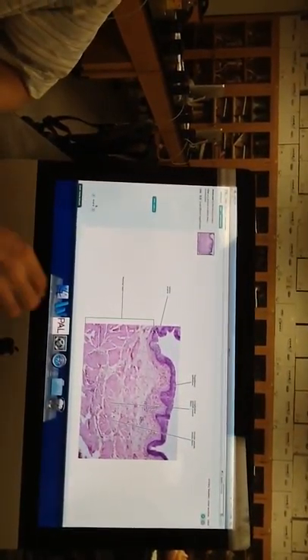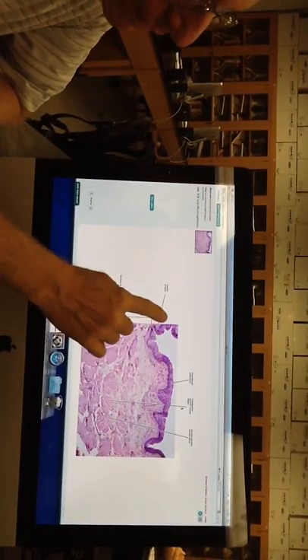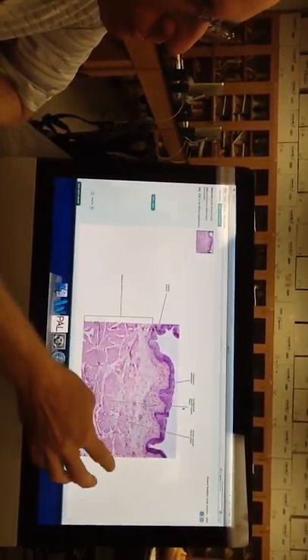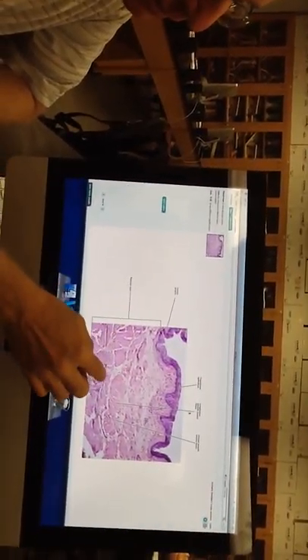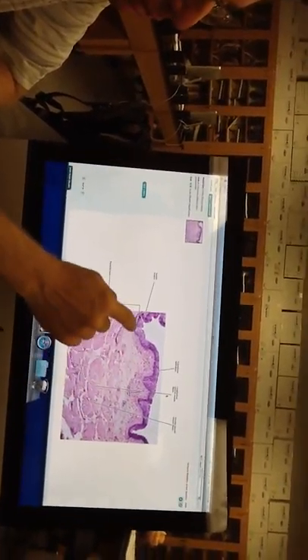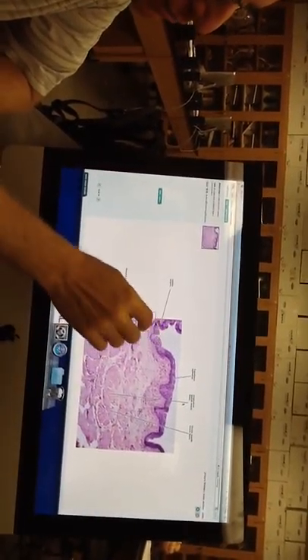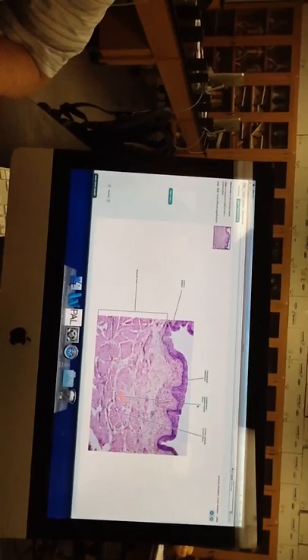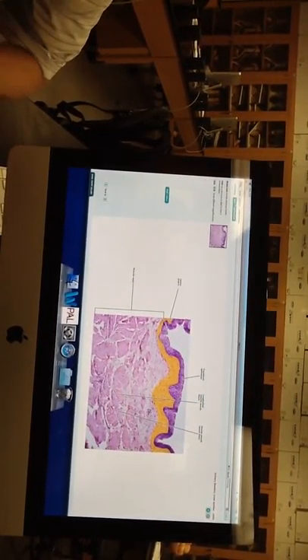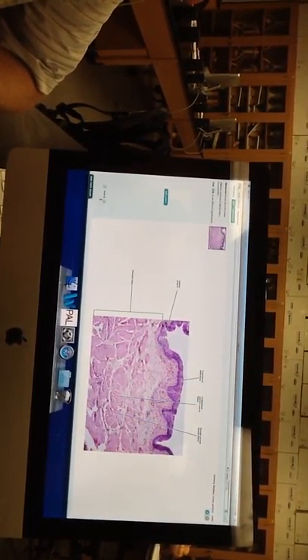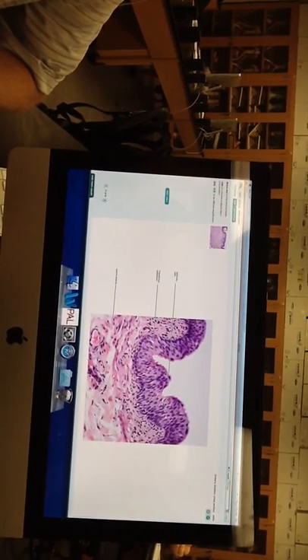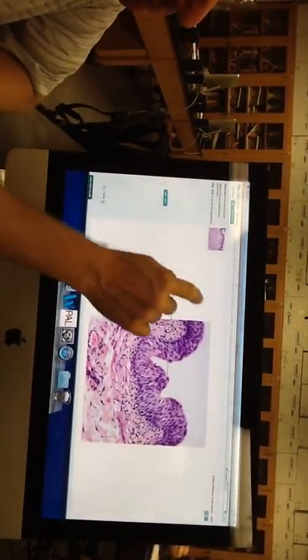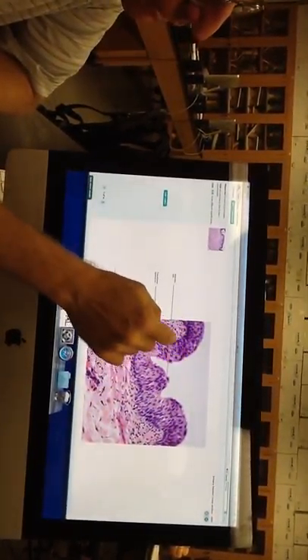Transitional epithelium with the cells all jumbled on top of each other because, remember, the transitional, because it stretches out, it transitions as the bladder fills, but it has to maintain a seal. So you've got that transitional epithelium on the surface there, and then this is all smooth muscle cells down here with very much like the gut, that layer of connective tissue that supports the blood vessels there.